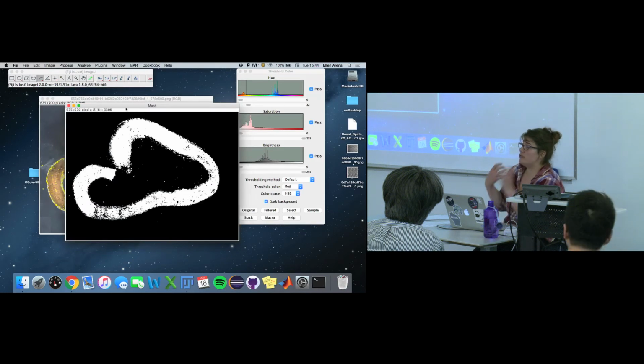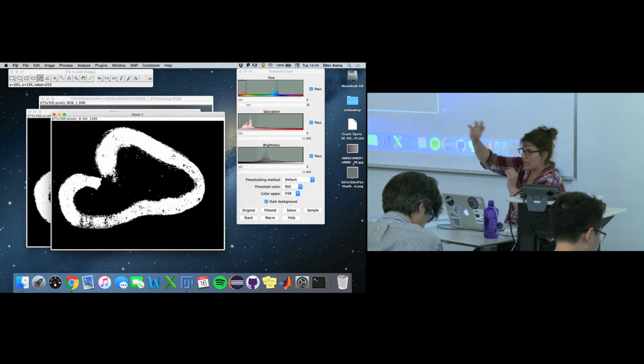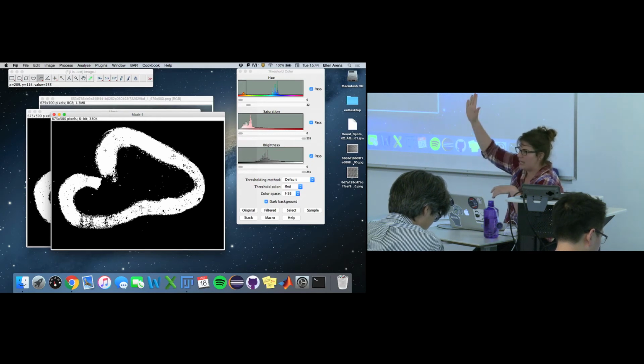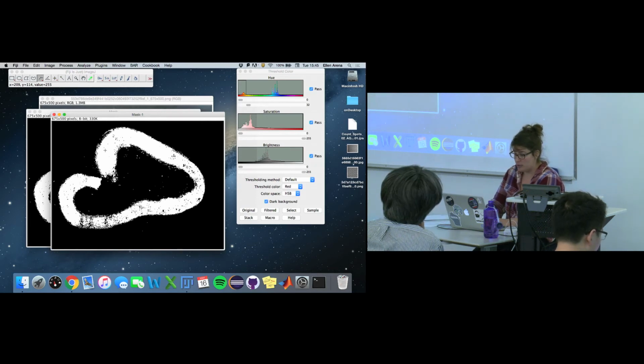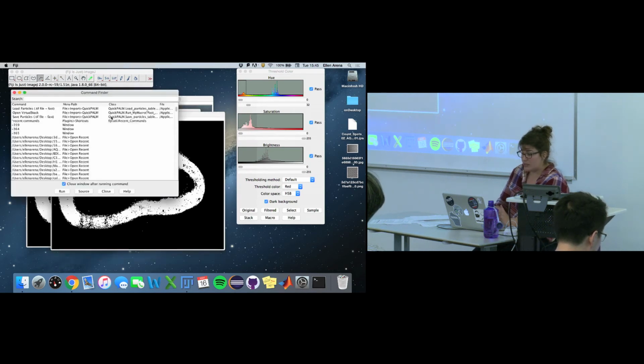Now for skeletonization to work properly, we really need this whole tube to be filled in smoothly, because skeletonization is going to find the middle of that tube, but then it's going to throw out little barbs, like little lines to areas along the width that are projecting outward or inward, that are a little bit of anomalies from the median width. So what we want to do is fill in these holes. We can now use binary morphological operators, such as fill holes. And you'll see this in action, it's going to fill in all those internal holes. But we still have some funky ones happening here.